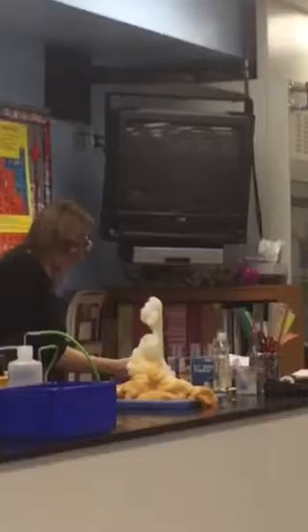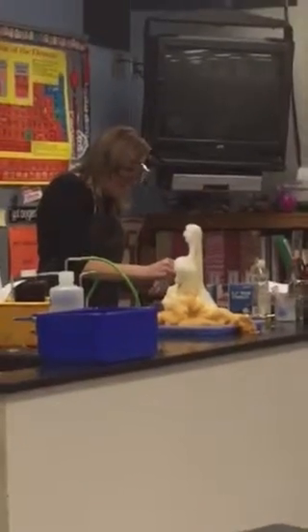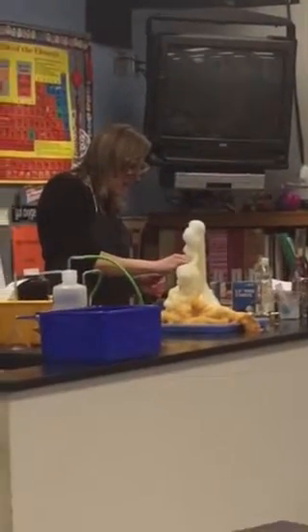It looks like foam insulation, yeah. What, you don't want to touch it? Yeah, it's really hot. It's still going. And you guys still see the steam coming off too? What kind of reaction gives off heat? That's another thing we talked about in this unit. Give me a science term for it.